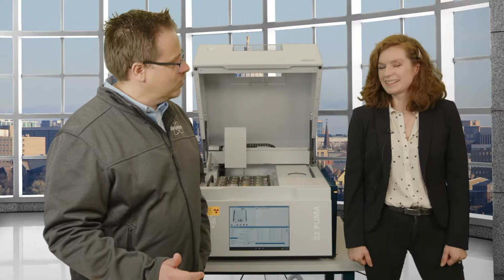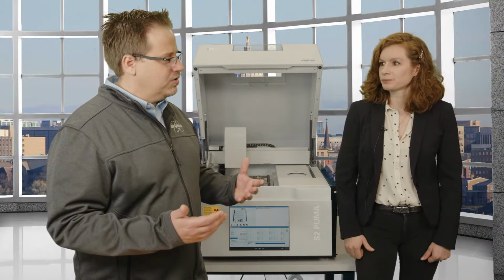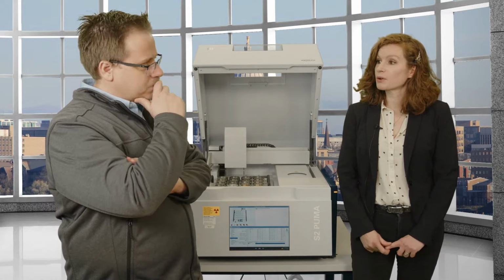Precision. It's an interesting word. Yes. Maybe since this is more of an intro, we also say accuracy sometimes, right? Right. And there's a difference. Correct. So what's that difference? Accuracy, versus precision. Accuracy is how good is your calibration.